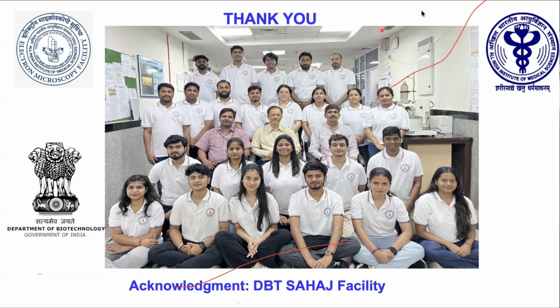But if the virus is going to produce some oncogenes like E7 and E6 that you want to correlate, then you have to use some kind of correlative microscopy. Nowadays a lot of new antibody fragments are available which can penetrate the cell and go into the live cell, and they can be used for both. They have fluorescence as well as gold coating, though it's very costly. They are selling it, but it can be used for that.